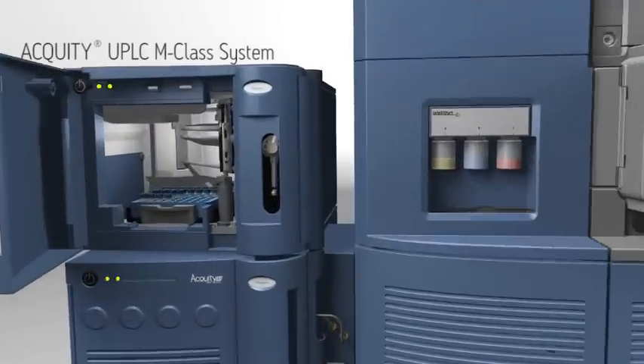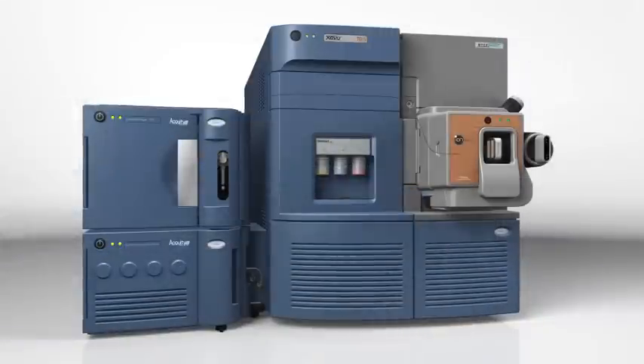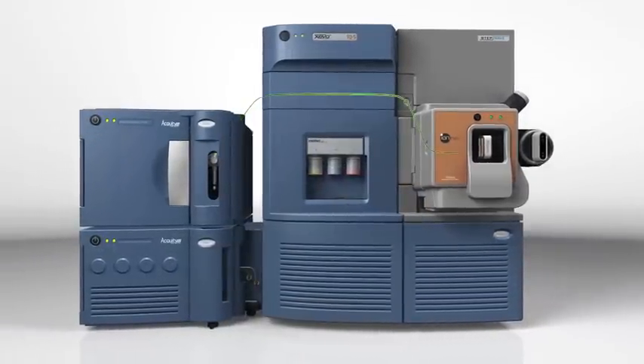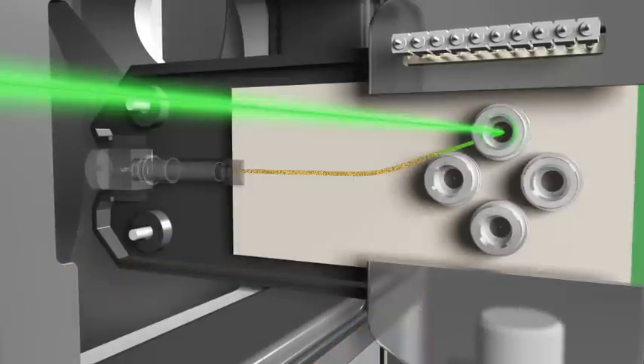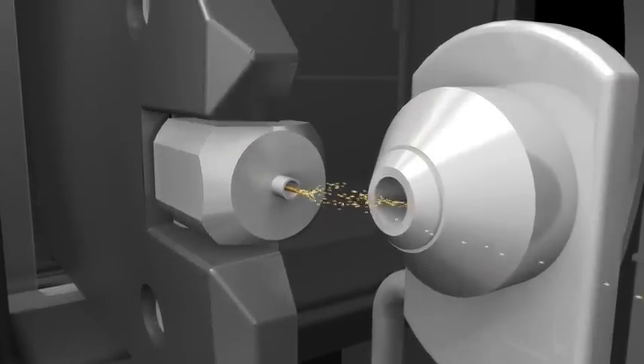The Acuity UPLC M-Class system precisely injects your sample and delivers accurate microlitre per minute flow, driving reproducible UPLC separations directly in the source of your Waters mass spectrometer.